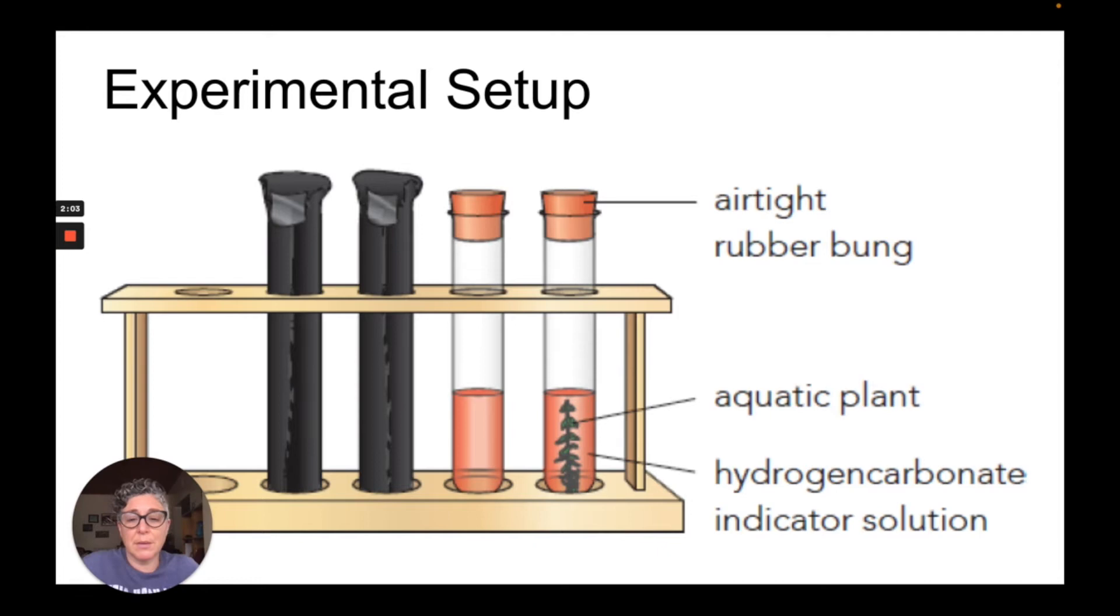This is what our setup is going to look like. We're going to have four test tubes. Two test tubes are going to be covered with black paper to represent the dark conditions and two test tubes will be exposed to light. The two test tubes with the black will look identical as to the contents. They're both set up with airtight rubber bung, meaning that air can't move in and out of those test tubes.